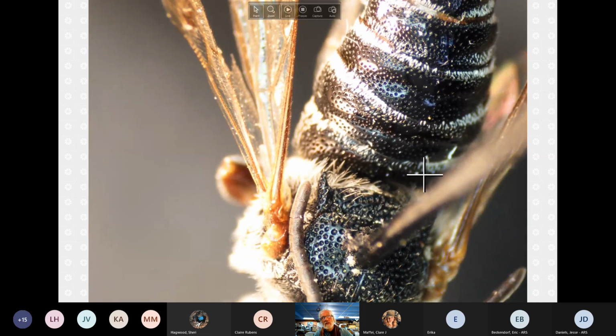So this is another one that's a little tricky to see. I'm going to shift this so that we're mostly concerned about what's going on in the central sections of the specimen. And what we will see is that in sayi and T2, this pitted groove goes all the way across. In T3, though, this pitted groove sort of peters out and becomes just a few sparse pits, and you really don't have a deep presence of that groove.